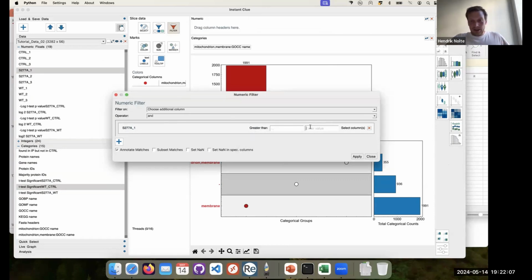So for example, everything that is greater than 25 or something indicates by a blue font if this value matches somewhere. So if you put a value in, say 0.2, and it doesn't turn blue, then it indicates that it's somehow out of reach of what you are filtering for.